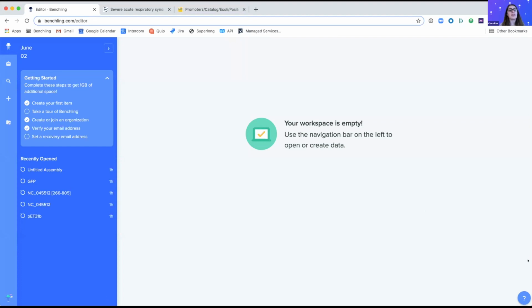And now, so again, welcome to the third installment of the training series for iGEM. For the purposes of the recording and to be less distracting, I'll have my camera off for this part of the presentation. It would be appreciated if everyone could listen to the demo that I'm going to be walking through and then try it out for themselves on their own computers once the demo is complete. It will be recorded for your own reference and posted to YouTube after the fact.